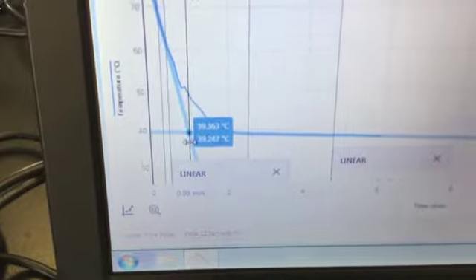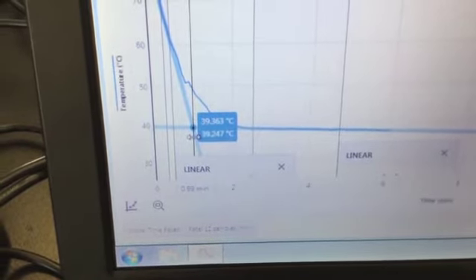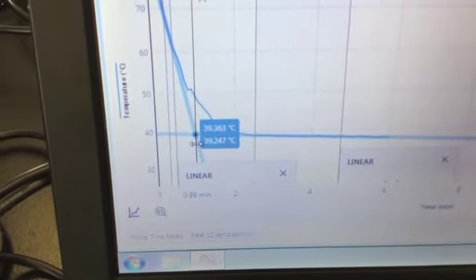Also, when I am using my calculations, I'm going to be using a freezing point depression constant for the lauric acid that only has 2 significant figures. So having 3 significant figures in my temperature should not affect my overall results.